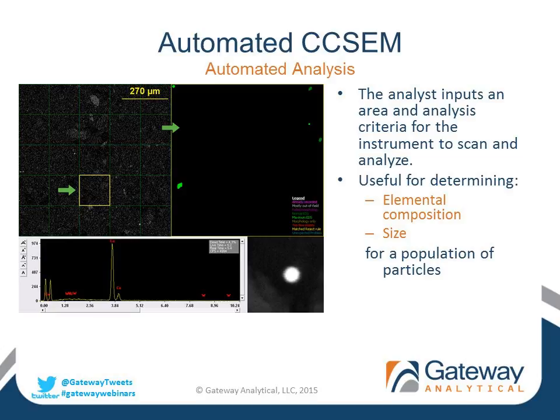And I'm now going to turn the presentation over to Dave to review some of our specialized techniques of glass delamination and automated Raman analysis.